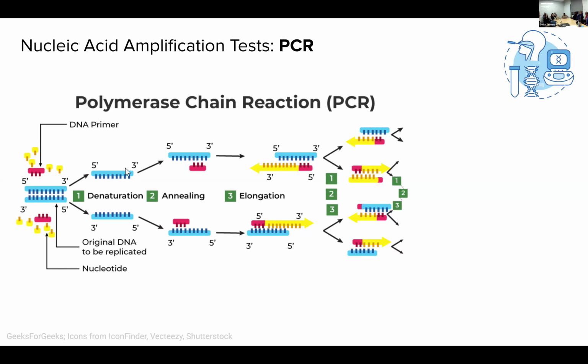With PCR, you're basically generating many copies of your target DNA. This DNA can be Schistosoma parasitic DNA, or you could have your SARS-CoV-2 RNA, and then you have to do reverse transcription into DNA and then follow this process. What it's basically doing is generating 2 to the n copies of your target DNA, where n is the number of cycles that you're going through.